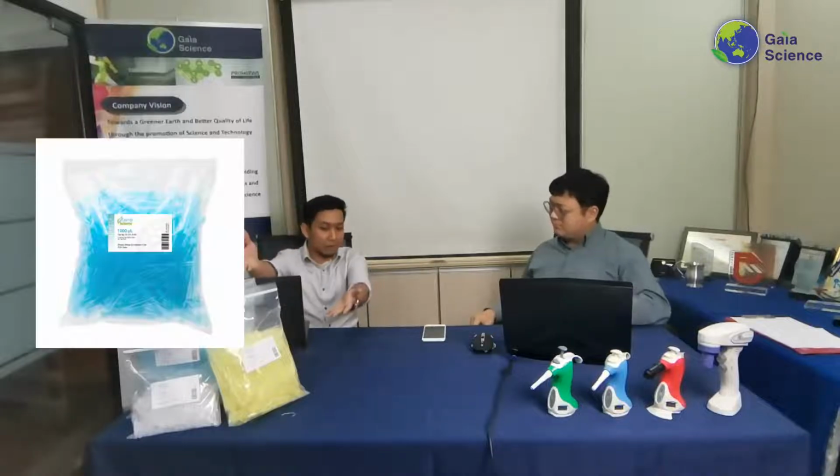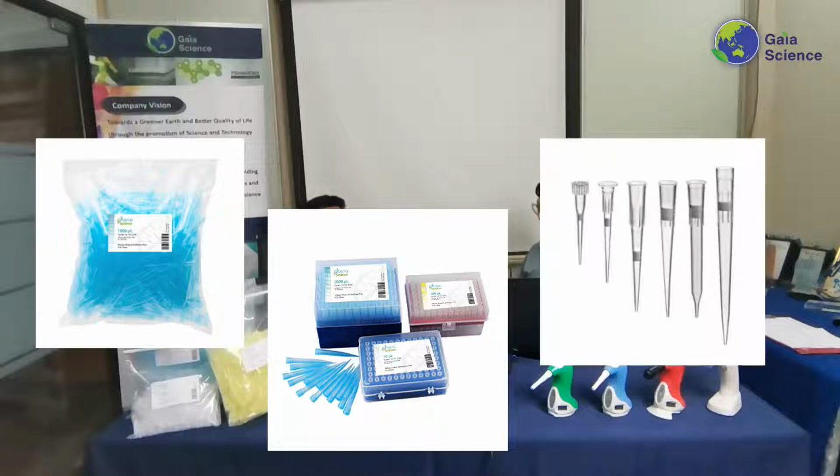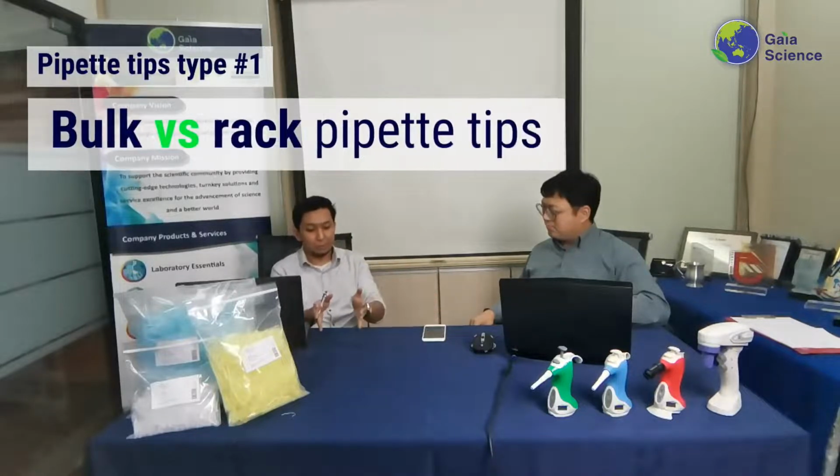So Dr. Tan, we're talking about pipette tips. There are so many options out there, and some people, for me, are very clueless. We have bulk tips, we have racks as well, and they come short, extra long, MLS, I don't know what else, and you also have low retention, wide bore as well. There are so many out there, but how to choose? First, the question that a new researcher like me might encounter: if we have bulk and we have rack, what is the big difference and how should we choose?